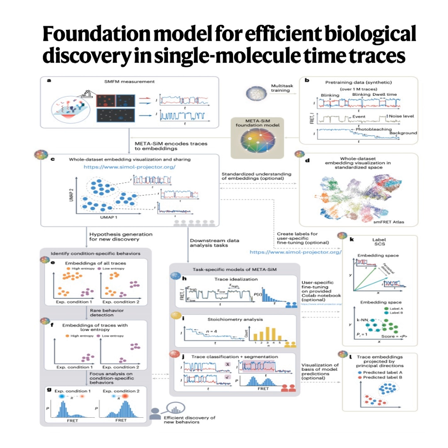And it treats these patches like tokens, almost like words in a sentence for language models. Ah, I see. So it's not just reading left to right. It can look at the whole trace and figure out which patches are most important relative to others. Like this little blip here matters more because of that big drop later on. You got it. It weighs the significance of different parts against each other.